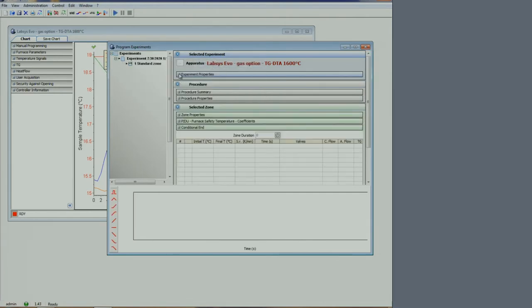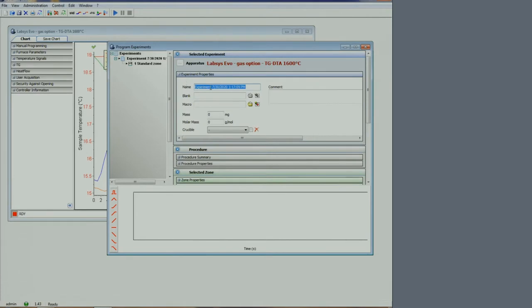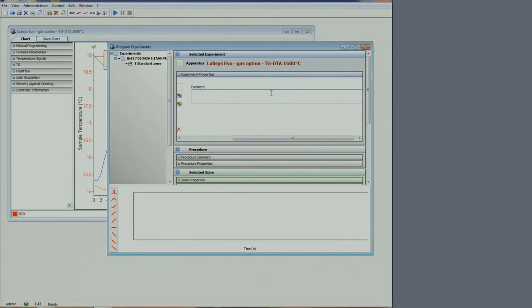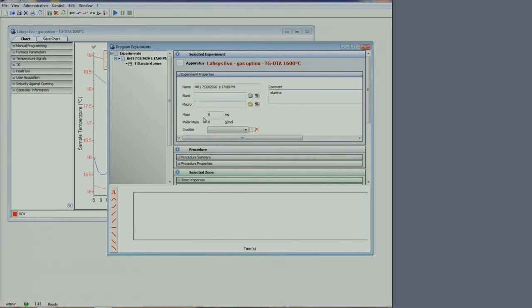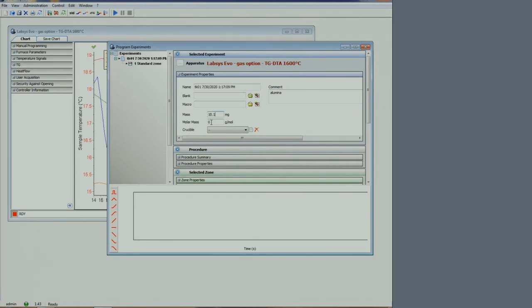In experiment properties, we can type the name of the sample. In the comments, we add the type of sample we have. Enter the mass measured earlier. And the molar mass; if unknown, you can type 1.